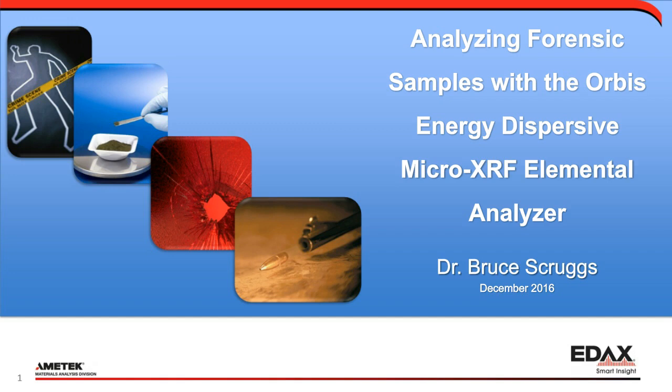Good day, everyone. My name is Bruce Scruggs, and I'm going to be talking about using the EDAX Orbis Micro XRF Elemental Analyzer to analyze forensic samples.